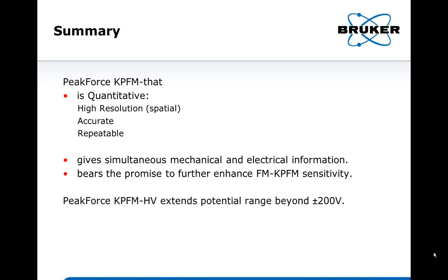For semiconductor, I'm not entirely sure how much it'll contribute. But for metal, we know if the thickness of the metal is less than 10 nanometers, then the underlying layer will also contribute to the measurement. For semiconductor, I'm thinking since the charge carrier density there is lower, probably you need a thick semiconductor layer to only read the top layer work function. Otherwise, you may see some contribution from the underlying layer. I don't know how much.